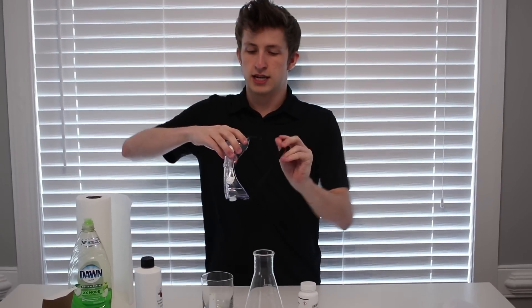And if you guys are enjoying and want to see more of these kinds of science experiments, fun things like that, smash that like button guys. Share with your friends and let's get right into this guys. All right guys, first, safety goggles on.